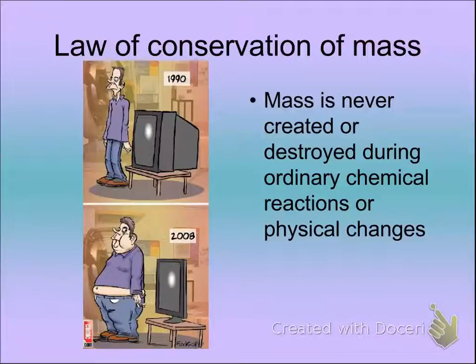Our discussion with a little sort of, let's see, what would we call it? Reflection on how hard it is to have everything go just right. So, you had 2 bags with 2 reactants in them. You ran a chemical reaction. It's a really simple chemical reaction. It's every 5-year-old's favorite chemical reaction, baking soda and vinegar.